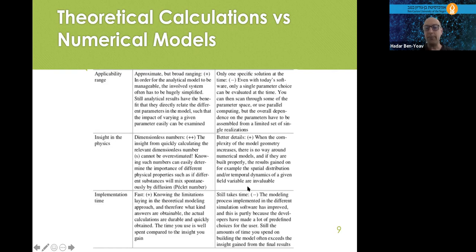numerical, it's a minus, and it's a very big minus, because you need a lot of time to build a model, then to correct it maybe if you did some mistakes, and then to apply the simulation, the software, and you need maybe to change it because maybe some parameters are wrong, and so forth. And also you need very strong computers, and the simulation can run sometimes even a day or two. So all of that is a big minus because it still takes time.